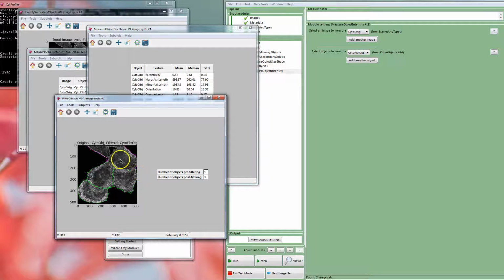It converts the values here, and if you look down the bottom right, you'll see these ones here are fractions of the maximum available. A lot of microscopes use 12-bit data sets, and so that will be a maximum of 4095, and so that will be a fraction of 4095. Or some data sets are 16 bits, so it's going to be a fraction of 65,000. And so double check that.